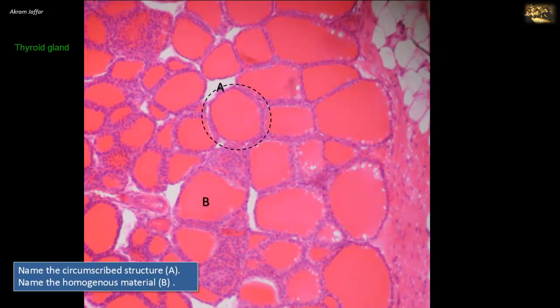This is a section of the thyroid gland in which the functional units are the thyroid follicles, marked A. They are spheroidal structures lined by simple cuboidal epithelium. The homogenous material in the center is called the colloid. The thyroid gland is unique among human endocrine glands in that it stores large amounts of hormone in an inactive form within extracellular compartments in the center of the follicles. Other endocrine glands store small quantities of hormones inside the cell.